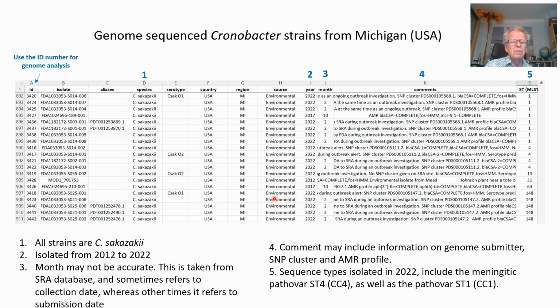We've got the month here, but don't believe that too accurately. Unfortunately, I find that the sources of the information I use vary. Sometimes the actual date they use is when they collected the sample, but sometimes the date is when they submitted the data to the central resource, and there could be an unknown time period in between. So sometimes just don't absolutely believe that number.